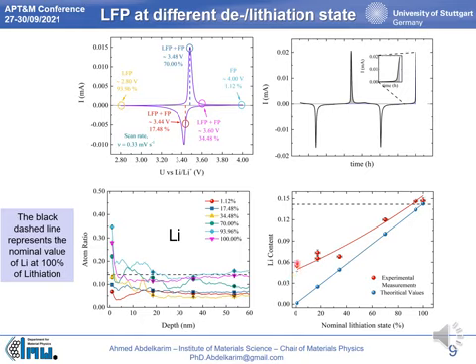This lithium excess in the fully delithiated phase may be described by inactive LFP regions inside the grains. The existence of such a high amount of lithium at the fully delithiated phase proves that the LFP, lithium iron phosphate, isn't entirely transformed to the FP, iron phosphate, during the delithiation. This is compatible with the radial model.